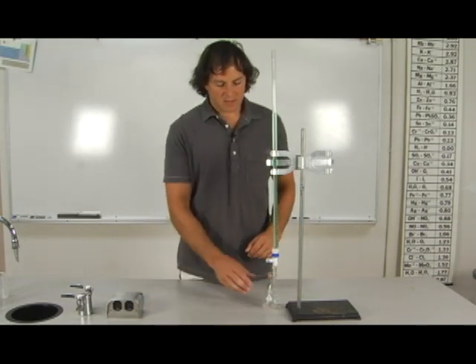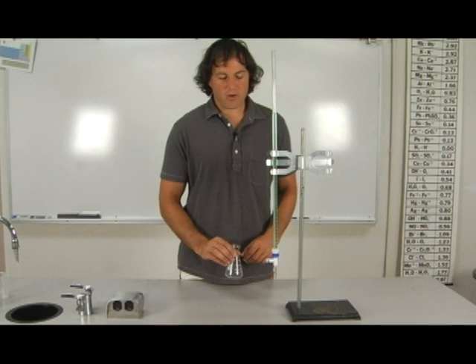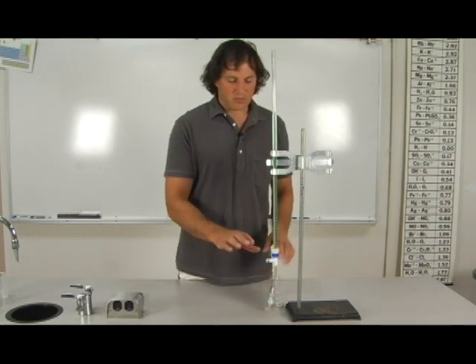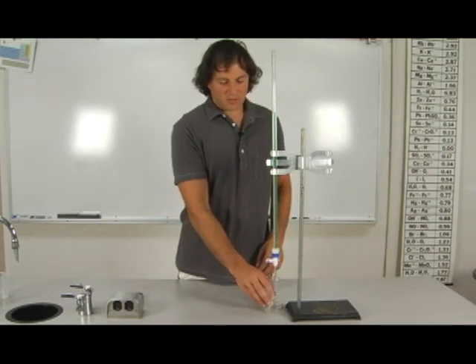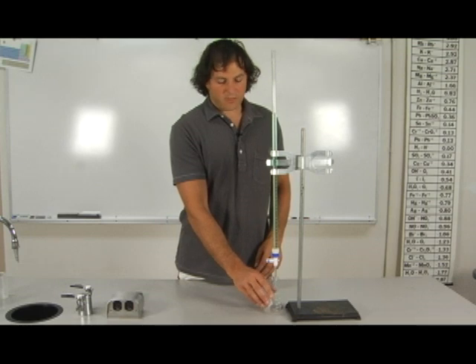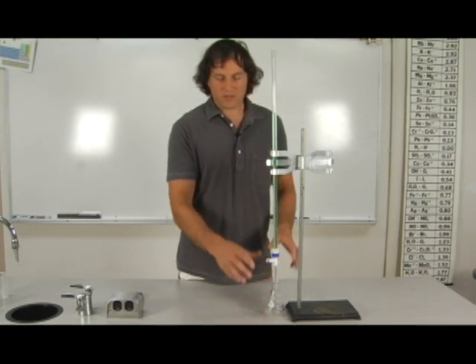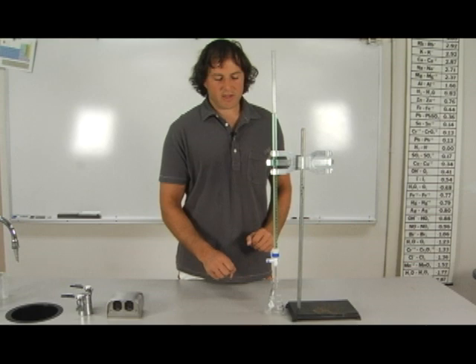We set the burette up on a stand and usually use an Erlenmeyer flask with this. Make sure that the burette's level is slightly below the top level of the Erlenmeyer flask. That way you tilt the flask in so all the fluid leaving the burette makes it into the Erlenmeyer flask.